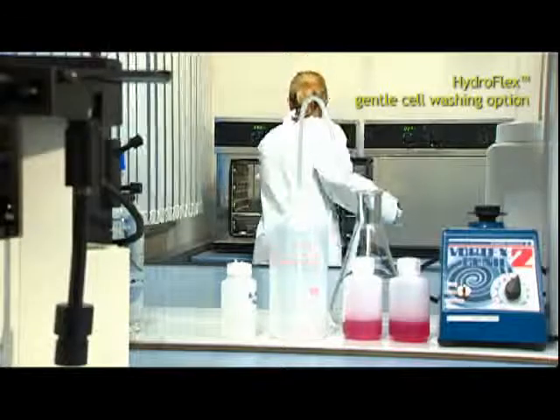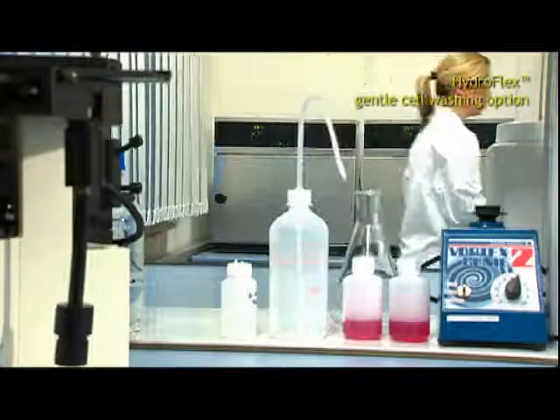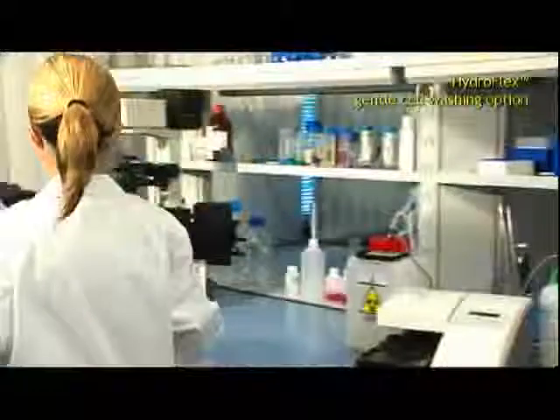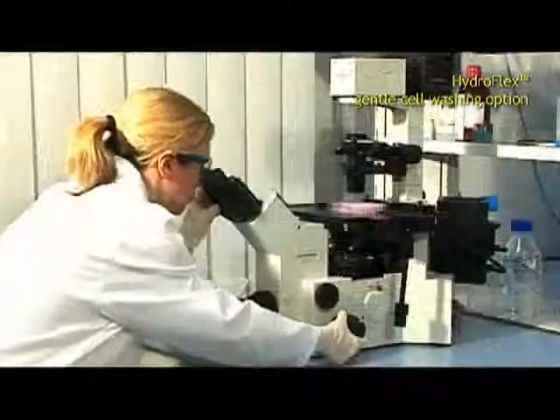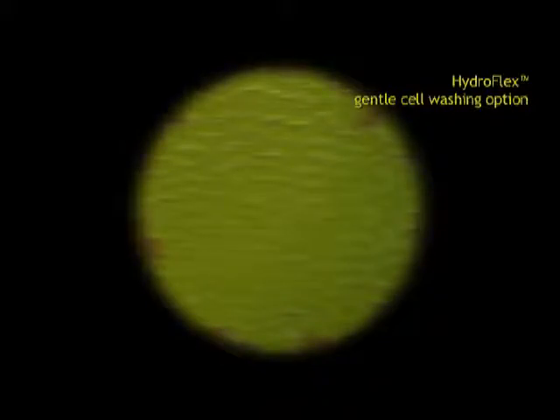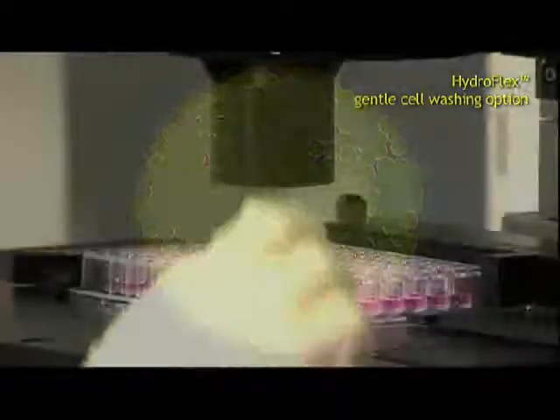Tcans Hydroflex is the solution for automated washing of cells. It's the instrument of choice for meeting special demands and treating various cell lines. The adjustable setting of each wash parameter allows even non-adherent material to be processed.